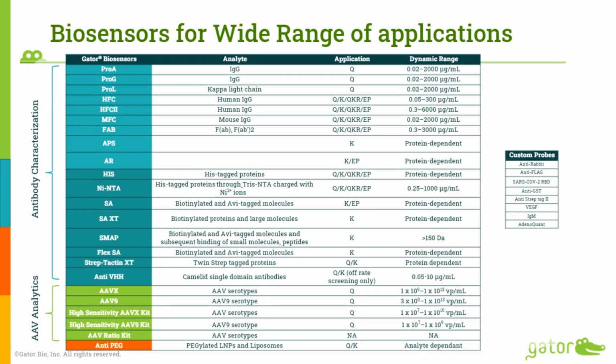Now, the question comes, what biosensors do you want to use? In the very beginning of setting up this kind of humongous study, we want to make sure we are looking at the cost, of course, but not only the cost, right. At the end, you also want to get data that is really meaningful and adds value.